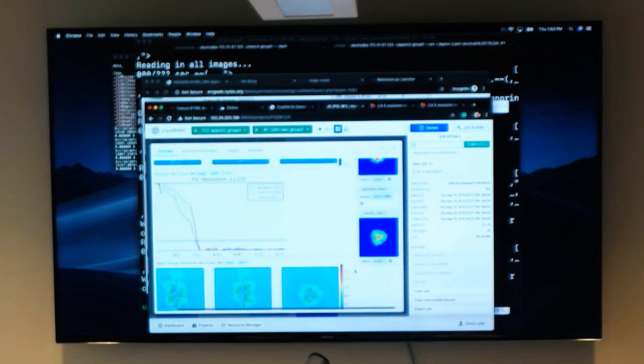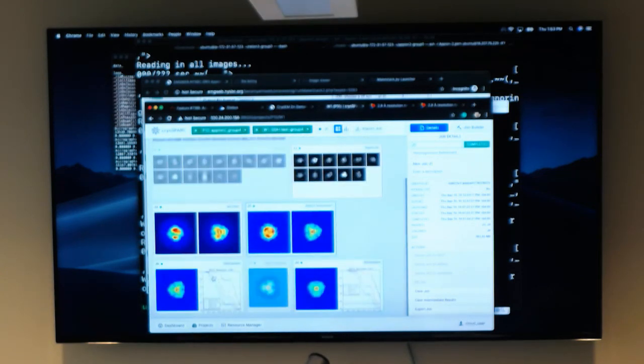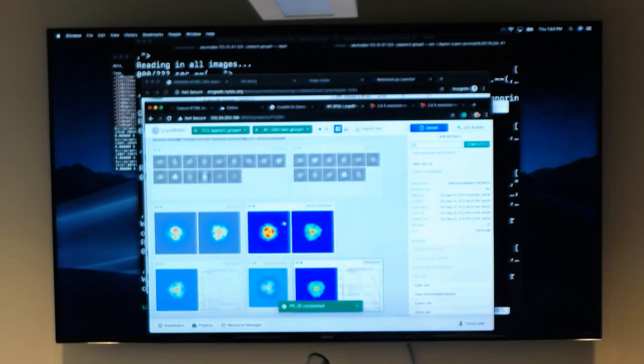So that means if you do heterogeneous refinement, then you'll have to choose these classes again to do a homogeneous refinement, which is one of these located here, which is probably J8. Well, yeah. So you can see like this, in red it highlights the inputs, and blue is what I'm selecting. So J8 is using this heterogeneous refinement.